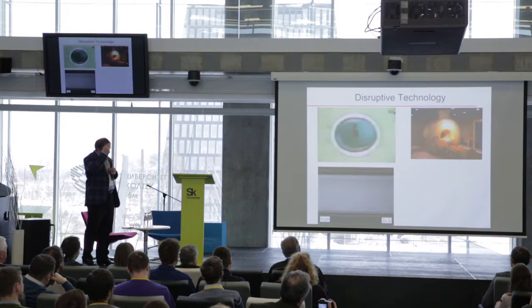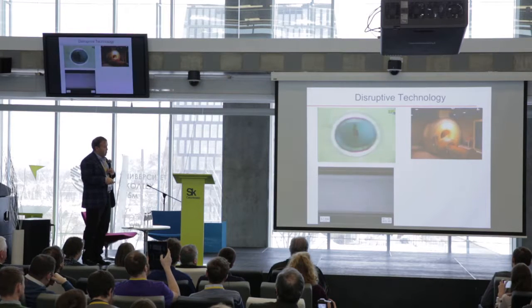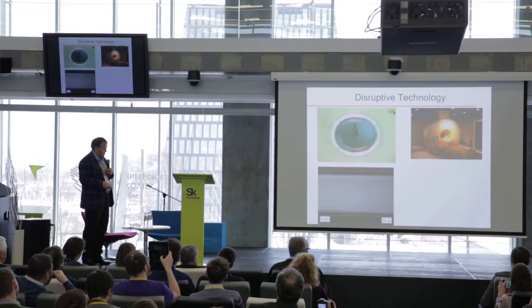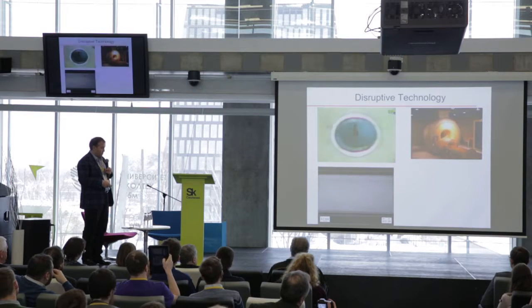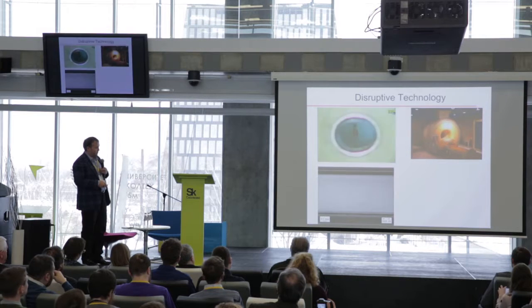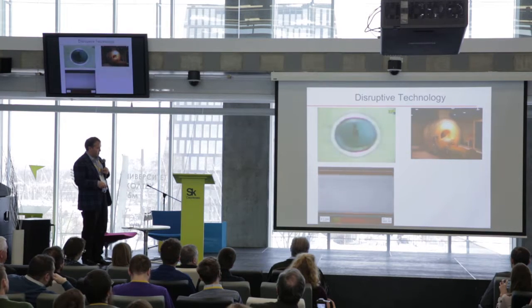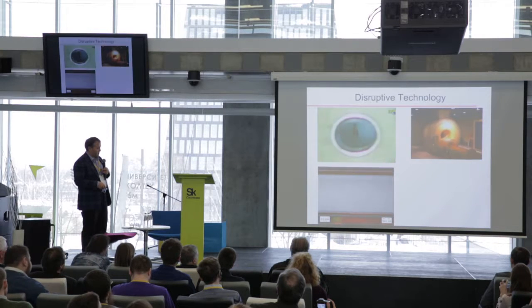So we took this idea, I think in 2013, and tried to change this system into a microfluidic system. This is about 1 millimeter in size, just a capillary, like a microfluidic type system, where you have single cells, and these cells are alive. We put them into an acidic environment, and the green is live, red is dead, and they are starting to die in this acidic environment, and the gadolinium that we use is going inside them, causing them to fall down.